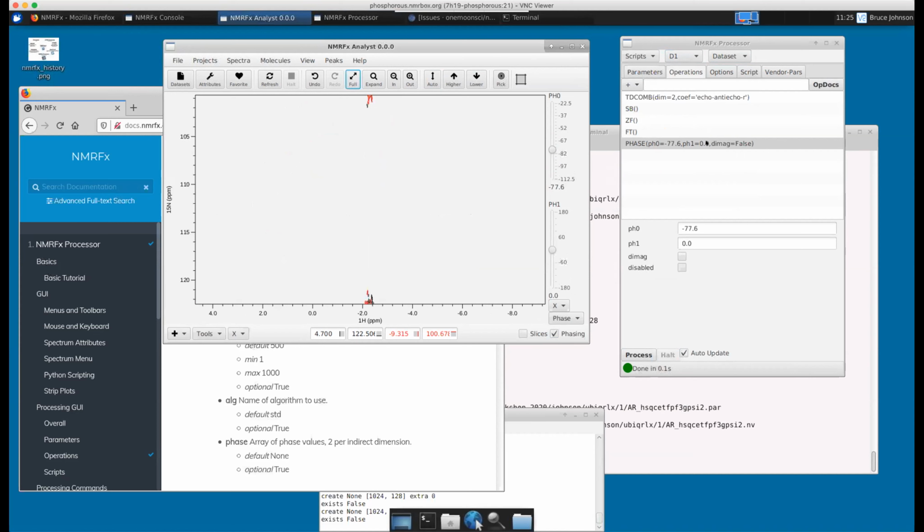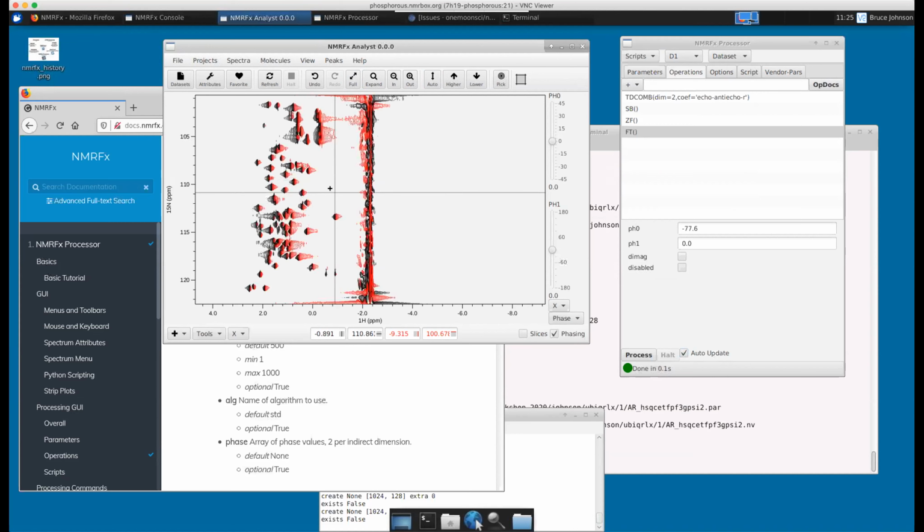Whoops. Oh, I see. It throws an exception there. Okay, it's just me, the issue of my setup. You inserted something, and I've also inserted something here that's messed this up. My phasing must have been wrong. Anyway... Oh, there we go. Okay.